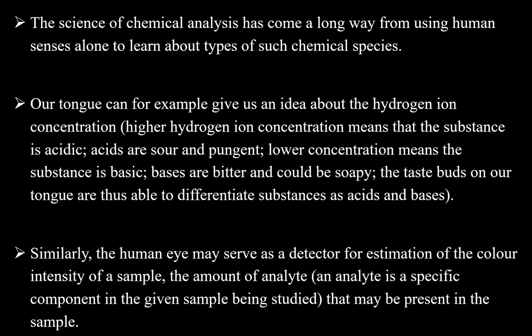Similarly, the human eye may serve as a detector for estimation of the color intensity of a particular sample, indicating the amount of analyte that may be present in the sample. An analyte is a specific component in the given sample being studied.